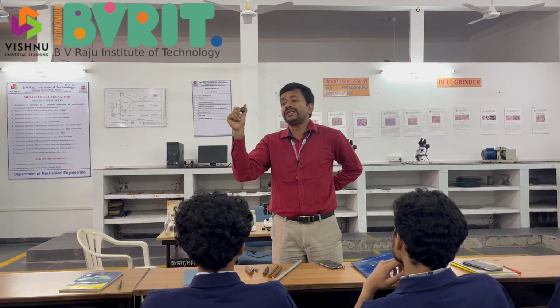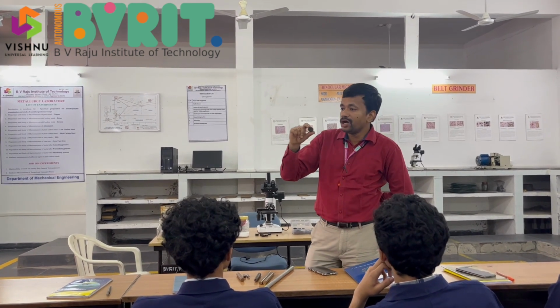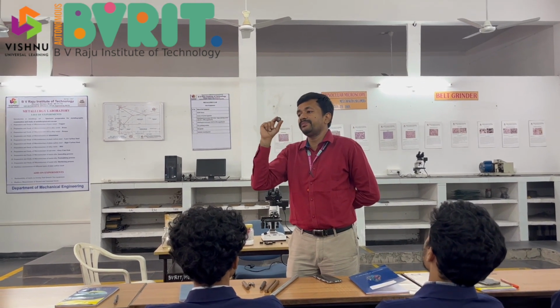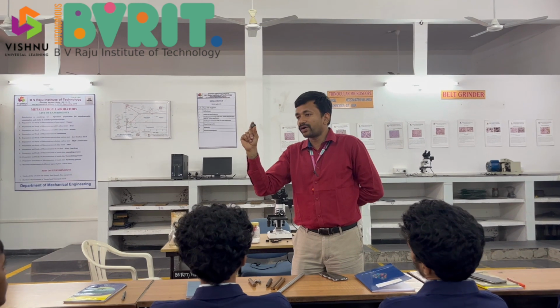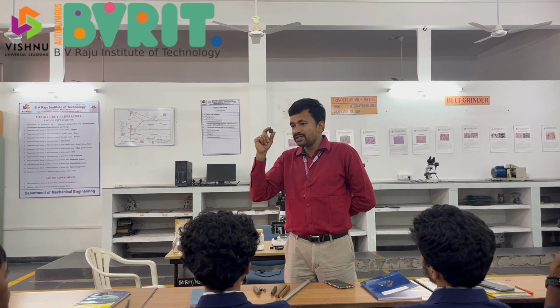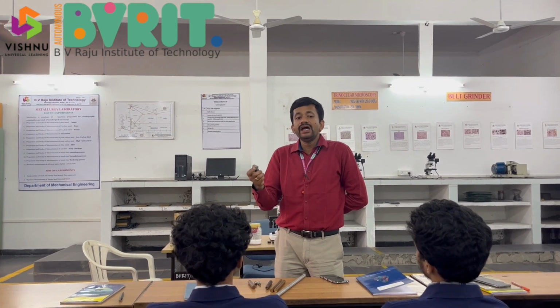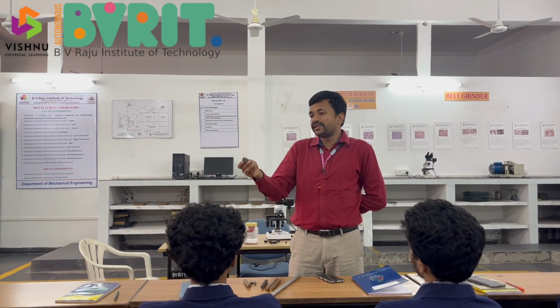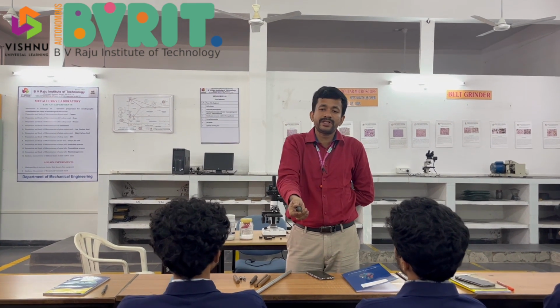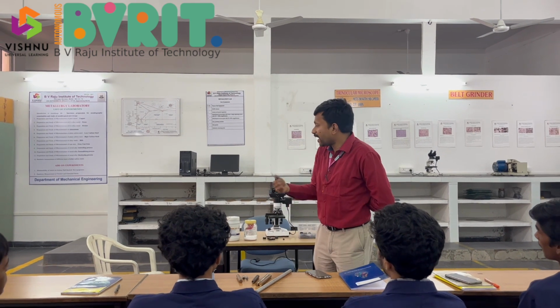Now that we prepare the specimen, for any metal which we want to examine in this lab, first we need to have the specimen prepared. Okay, so that is the first step. The specimen preparation is what we are going to study today after this demonstration, and then from the next lab onwards, for the sake of time, we will give you specimens which are already prepared. Okay, now coming back, next step.